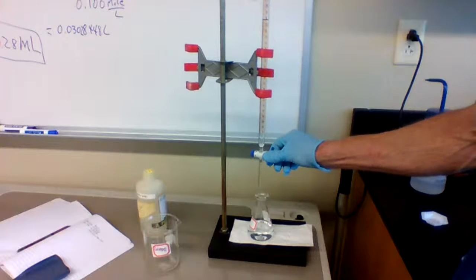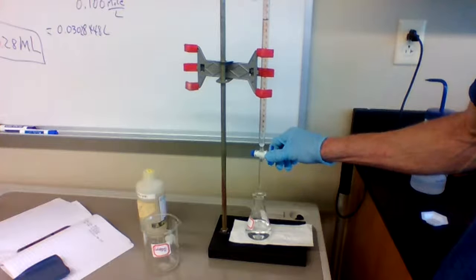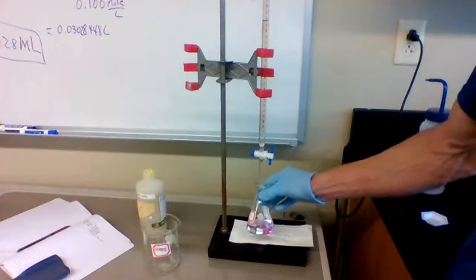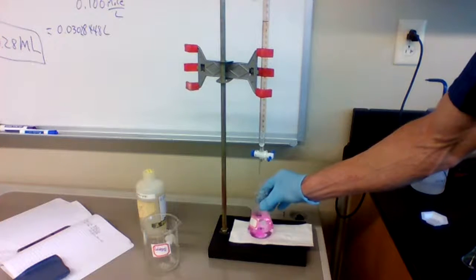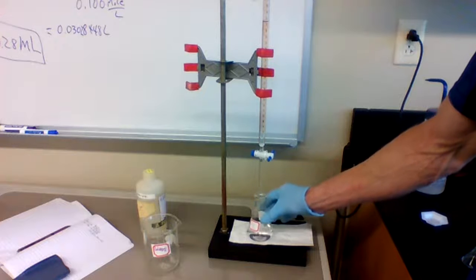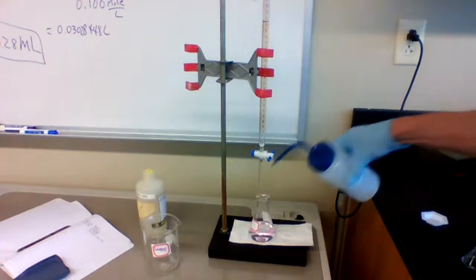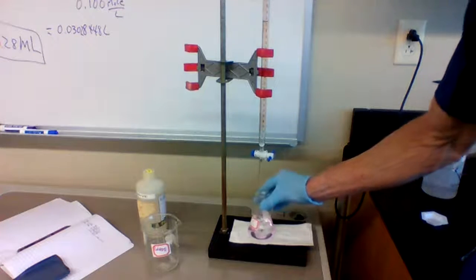And I'm going to follow that method that I was talking about by just getting a droplet and letting it go, touching it on the side if we can, stopping it. Oh, we're so close, folks. We might be there.